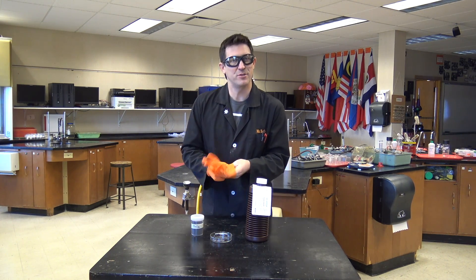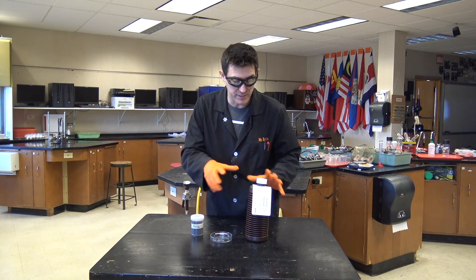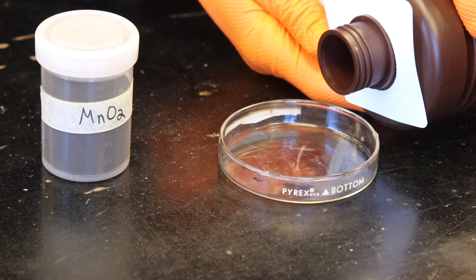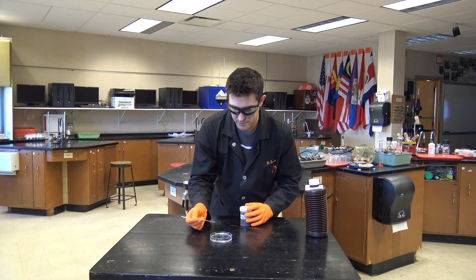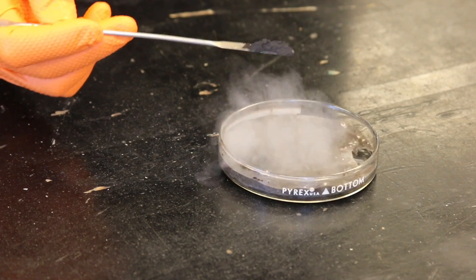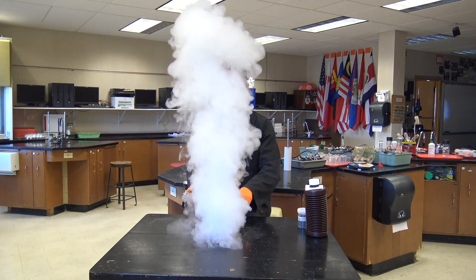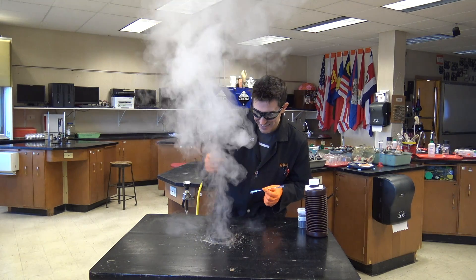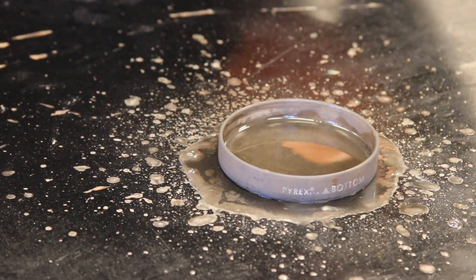I want to show you how this decomposition reaction works when it's not confined inside that Florence flask — you can really see what's going on. I'm just going to add a little bit to this Pyrex Petri dish. There we go! I've got a mess to clean up.